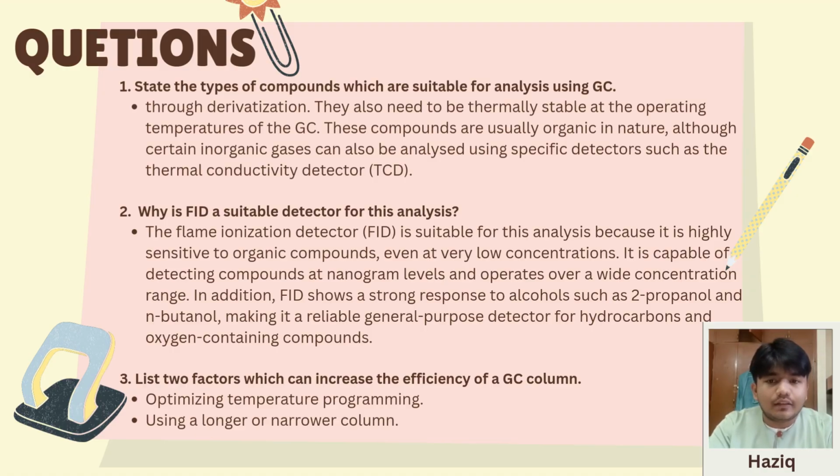In addition, FID shows a strong response to alcohols such as 2-propanol and N-butanol, making it a more reliable general purpose detector for hydrocarbons and oxygen containing compounds.